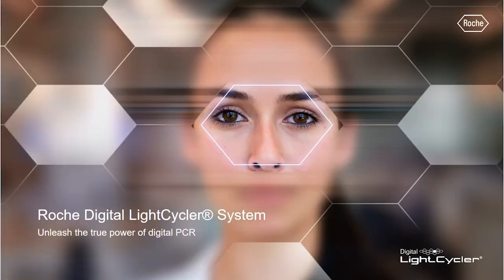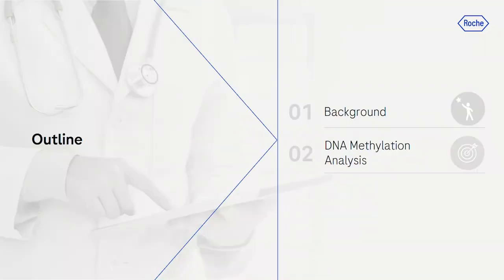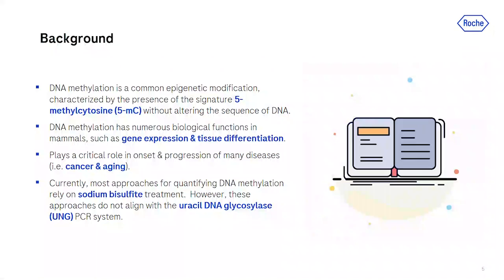Thank you for the introduction. The topic I'll present is quantification of DNA methylation using methylation-sensitive restriction enzymes and digital PCR. First, the background of this study will be presented.